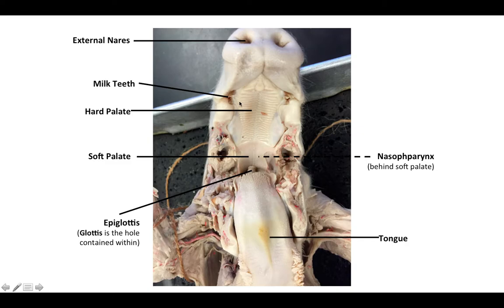And be careful, the fetal pigs have some teeth. They're small, but they are kind of pointy. So just use care when you're opening up the jaw.